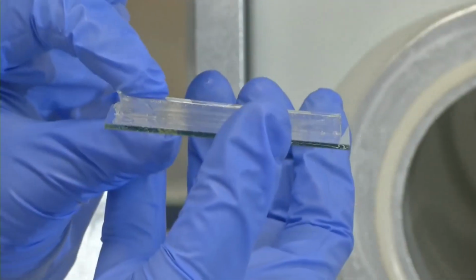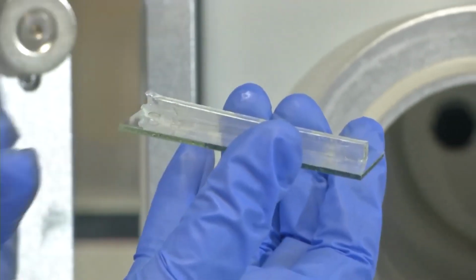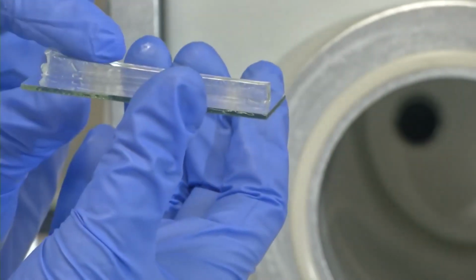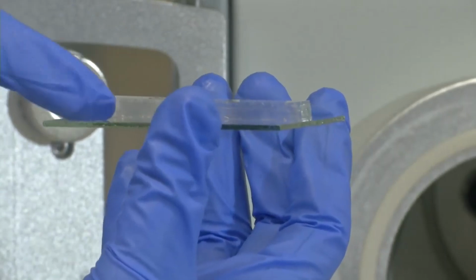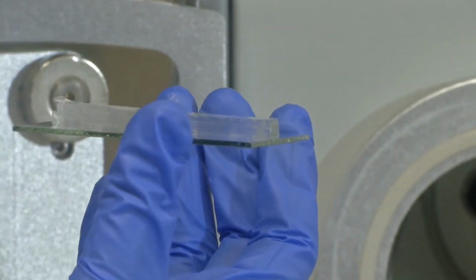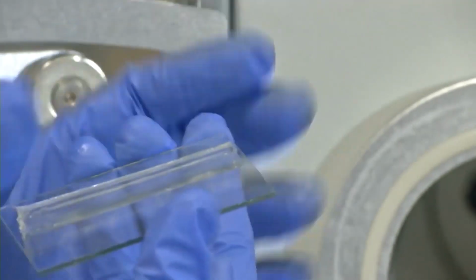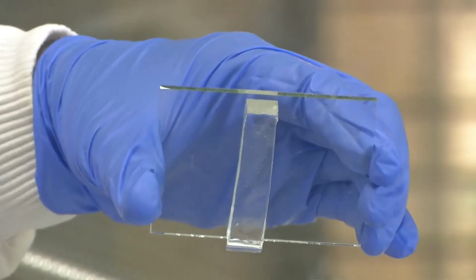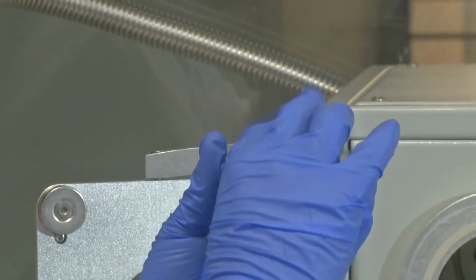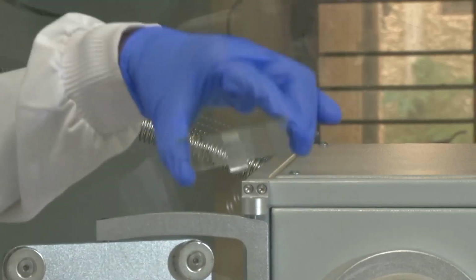Okay, so I have kept the PDMS membrane and the glass substrate on top of each other. The surface of the PDMS membrane that was exposed to the plasma is touching the glass slide, and the glass slide's surface that is treated is touching the PDMS membrane basically. So I have kept both of them together and they have bonded. You can shake it and see they are not coming out, they are nicely bonded.